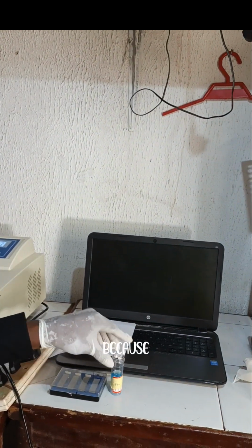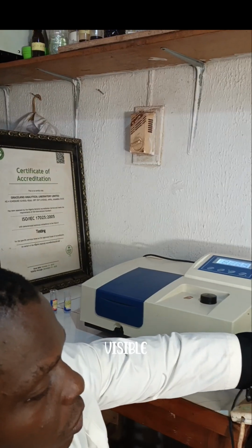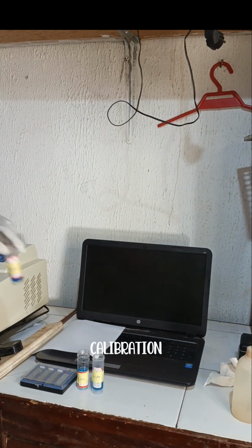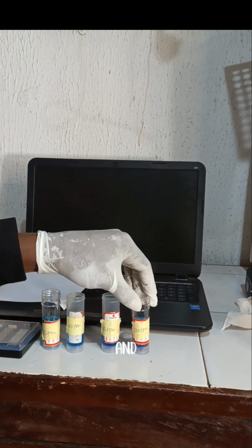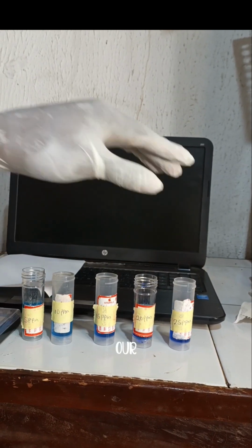Because for every determination you do in UV visible spectrophotometry, in short, anything you are doing in a spectrophotometer, you have to do what is called calibration. So these are standard solutions that we use in the calibration. For today's video, we are using methylene blue to depict our experiment.